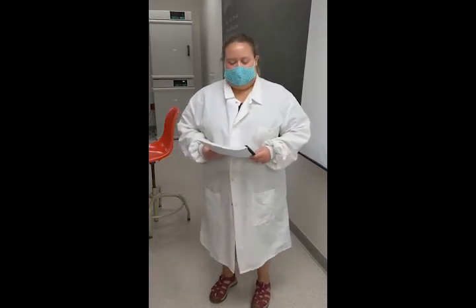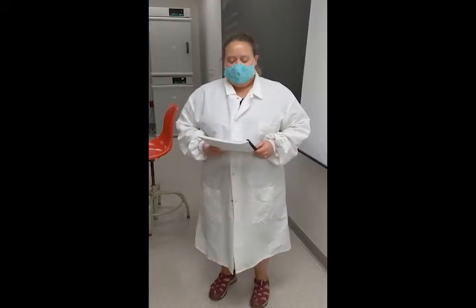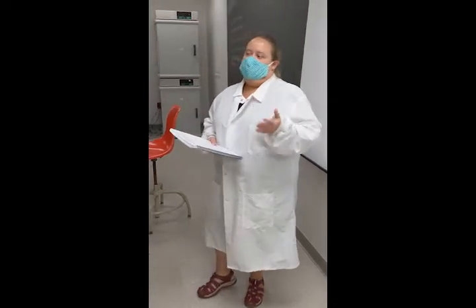Hello everyone. I'm going to talk about lab safety. Accidents in the lab are often caused by improper or careless procedures. For this lab, we want to demonstrate how lab safety is very important.